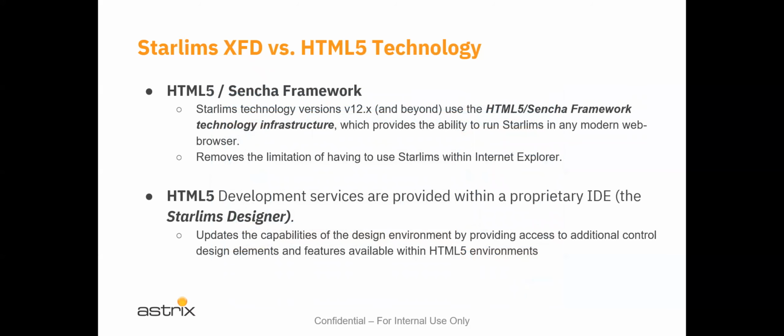So HTML5 came into the world, and STARLIMS needed to catch up, and we produced something at the time that was a kind of a bridge, and I'll use that term again because there is a specific tool that is installed on some STARLIMS systems, which allows the XFD system to, quote, bridge over to the HTML5 Sencha framework. STARLIMS uses V12 and beyond for the HTML5 Sencha framework tool, and it provides the ability for STARLIMS to run on any HTML5 compatible web browser.